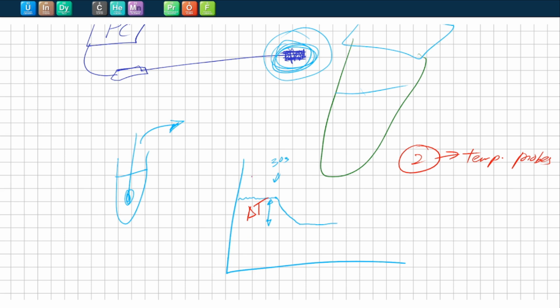So on the screen you should see a second graph with the same process going at the same time, and they might not happen at the same rate. So the two temperatures might drop at different rates because you'll have two different samples of liquids to test at the same time. So as a reminder, as always, be prepared for lab, dress appropriately, bring your eyewear.